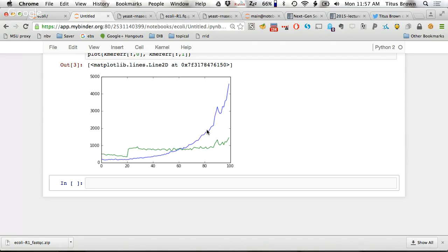And this is the kind of thing you want to look at and go, oh, I want to get rid of reads that have that level of mismatch at that position. Because if I use reads that have this position to call variants, then that's a higher error rate than I would normally expect. So I didn't realize I still have this bug in the released version of the software. Anyway, okay.